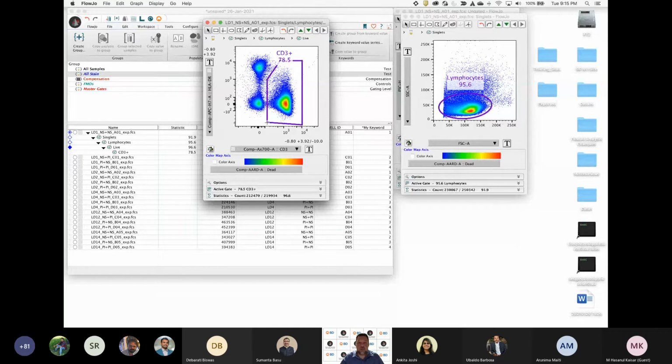Now I'm showing you really nice data, right? This is data that is well distributed. Sometimes your data looks really nice coming off the instrument. Sometimes it may look squished around the zero axis, the negatives might look squished, or they might look really wide or spread out. These are visual changes, due to the binning of the data within this visual space that's being presented.